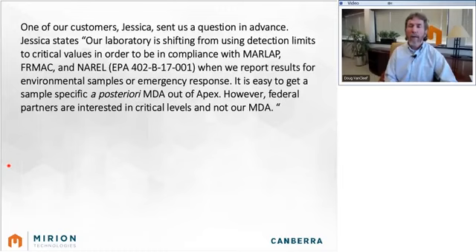again. Some of the early ANSI standards published back as far as 1978 have been misinterpreted to suggest that these calibrations need to be done more frequently than that. But I think as long as you have a quality control process that shows that those parameters have not been changing over time, you're good to not continue to do calibrations.